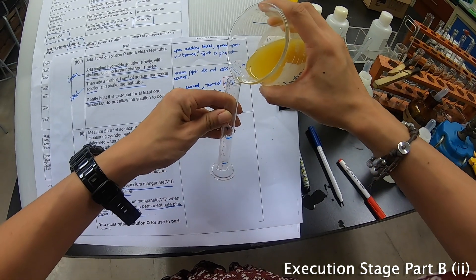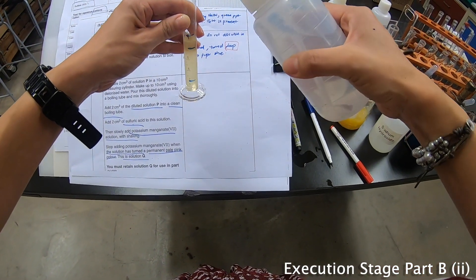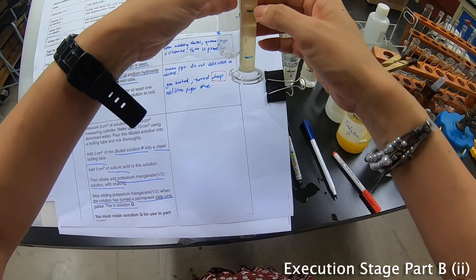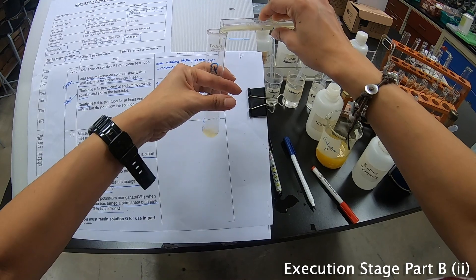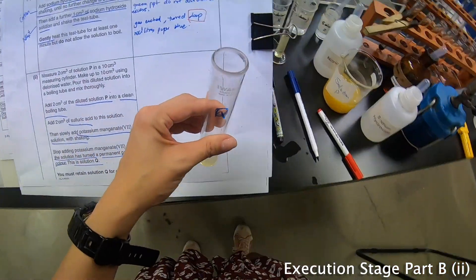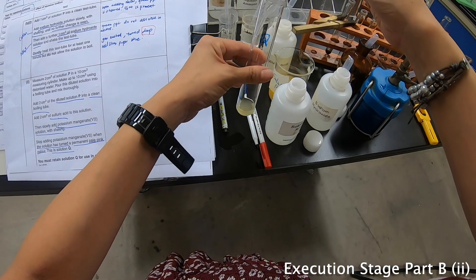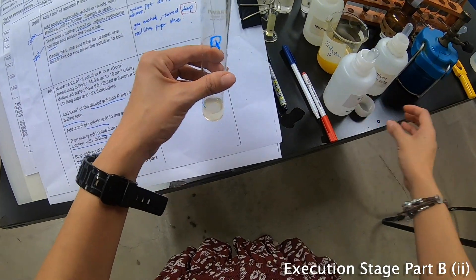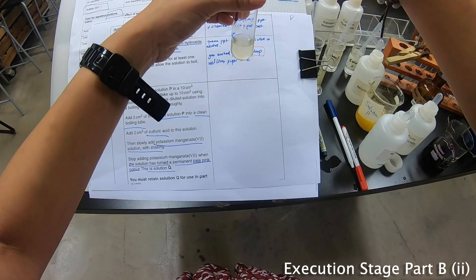So let me lower it so everybody can see. I'm going to make the solution up to 10 cm³, and then pour some out to this level. Then they say add 2 cm³ of sulfuric acid. Let me take out the sulfuric acid — it's here. That's about 2 cm³, let me add a little bit more.